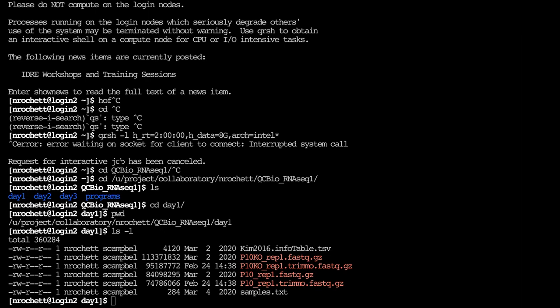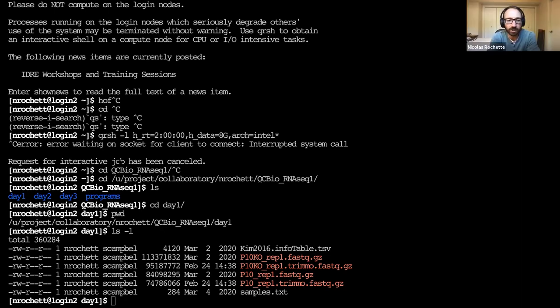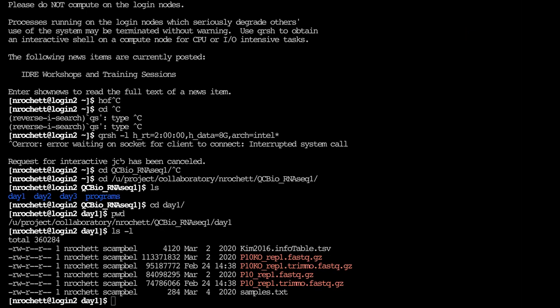That makes sense. I'm just wondering, if this is sort of a generic database of this mouse genome assembly, why isn't there just a pre-made STAR database for a given assembly? It's just that they would have to maintain so many databases. Very often, if you're in a lab where several people routinely do alignments to the mouse genome, and everybody's using the same version of STAR, then everybody would probably be using the same database because there is no reason to maintain several databases.